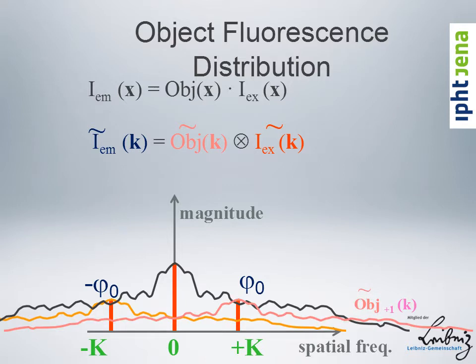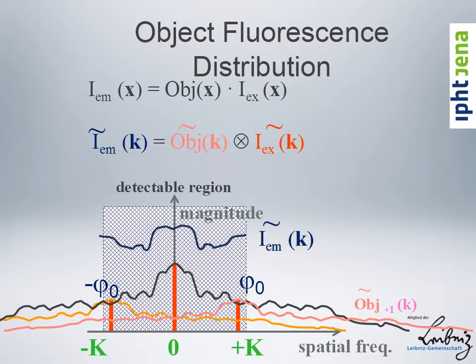So in other words, this is a total mess, right? We have an overlap of an object with itself copied 2 times around, 1 time shifted to minus k, 1 time shifted to plus k, and then phase shifted in the complex plane and overlapping. So what you get is a messy function here that is very tangled, if you want. And this, remember, was the Fourier transform of the emission pattern.